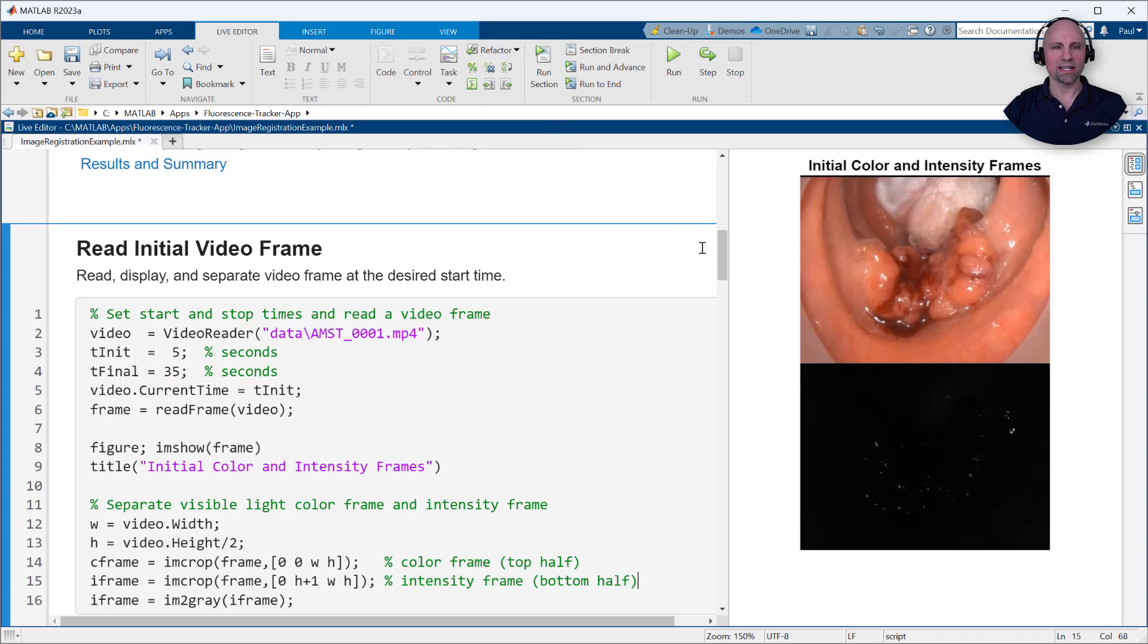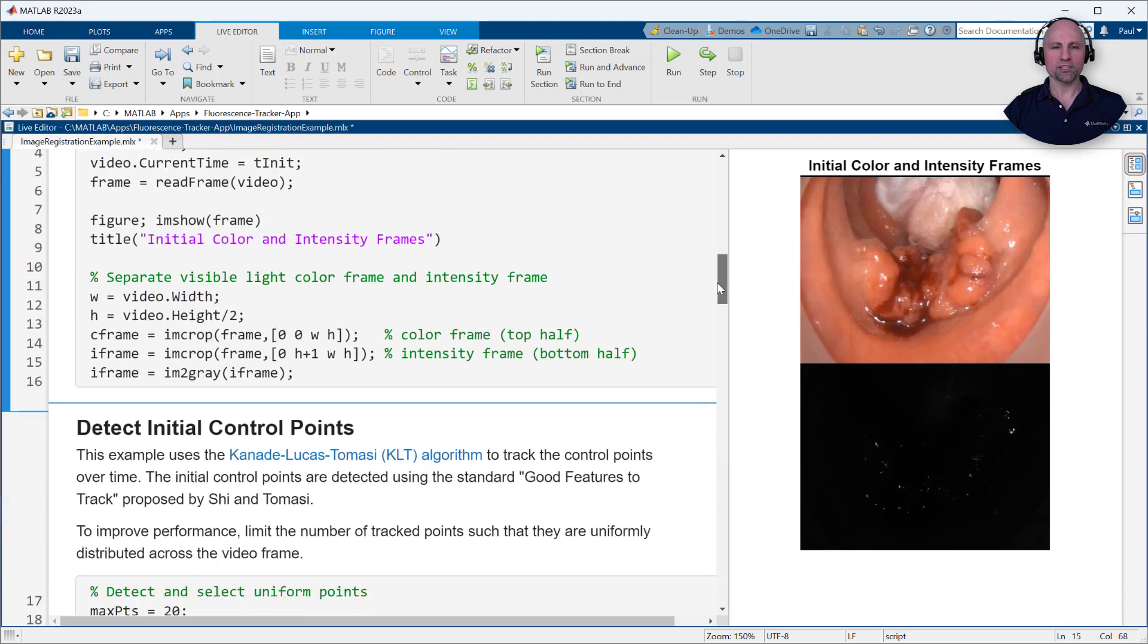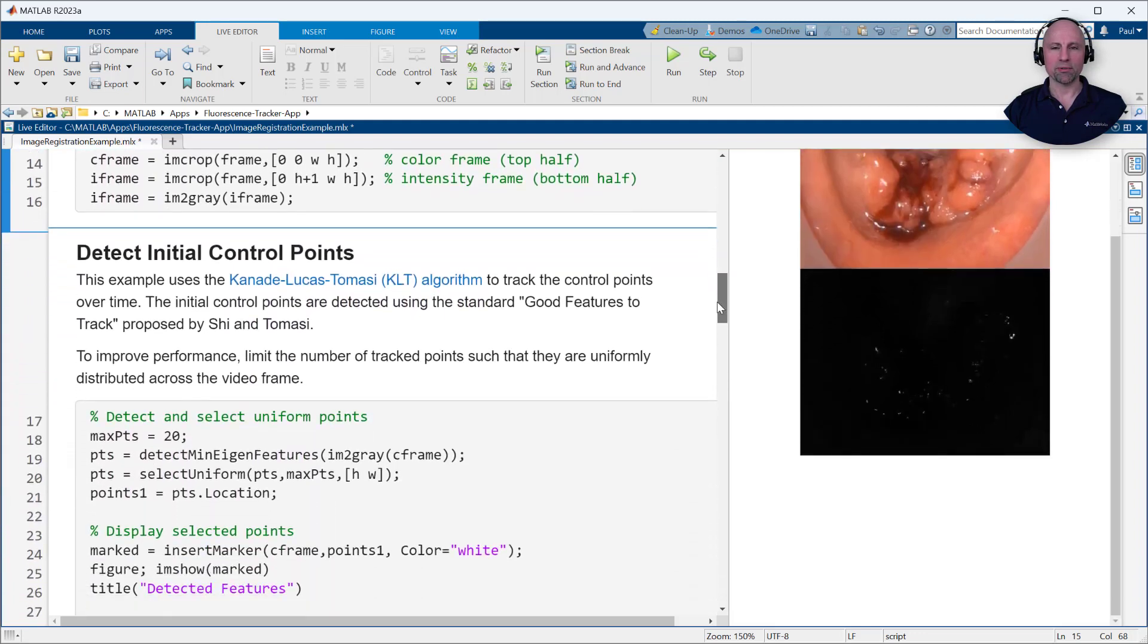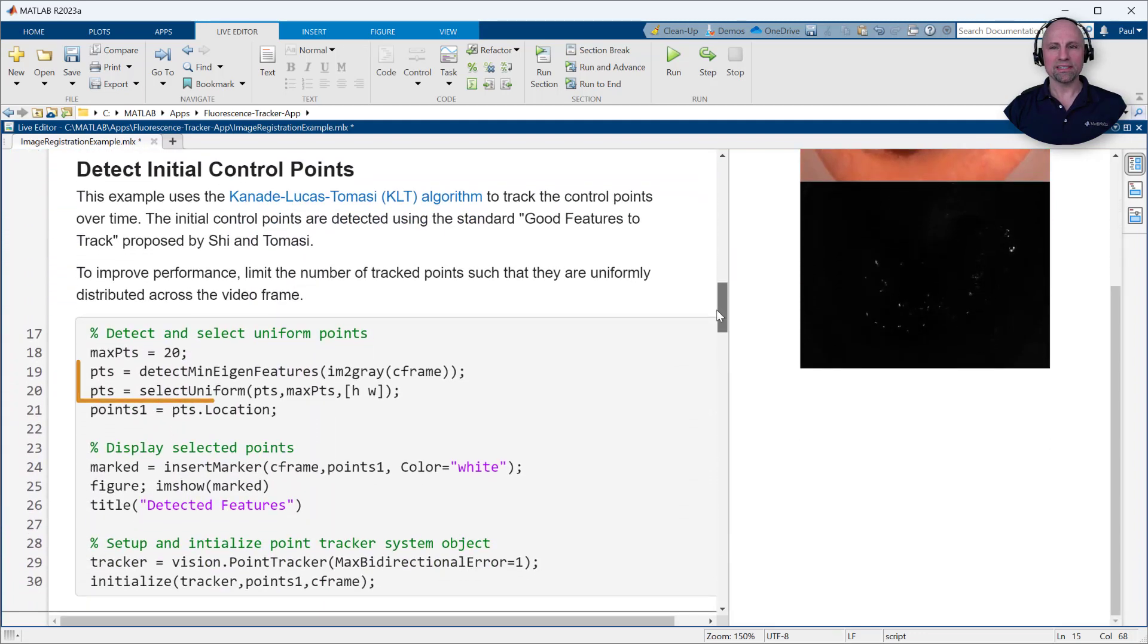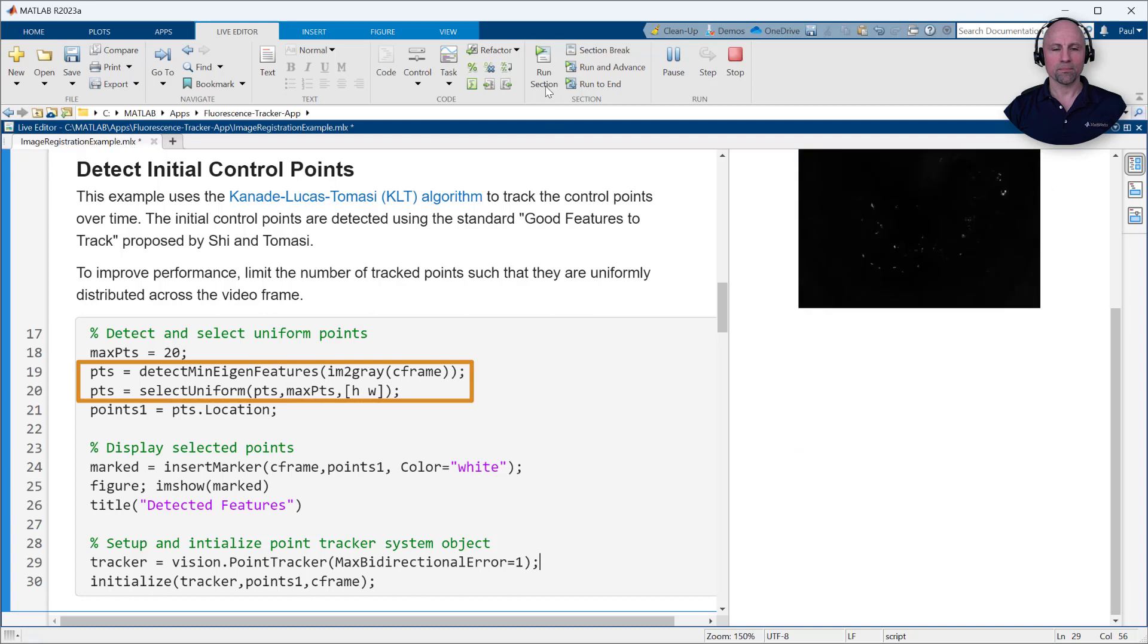Notice that since the dye has not yet begun absorption, the intensity image is mostly black. Since there are no features for us to track in this image, we'll once again detect and track points in the white light color image.